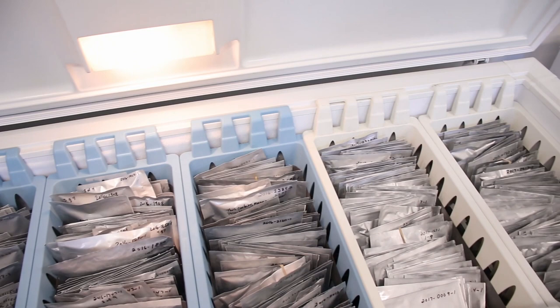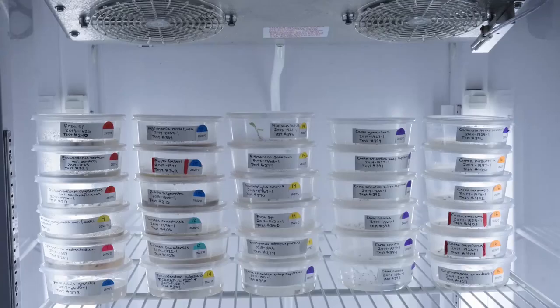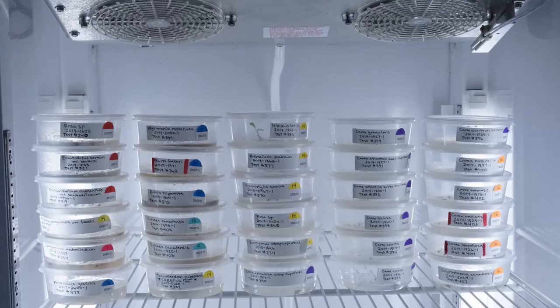Here at the seed bank, my main focus is viability testing. So what I do is pull a sample of seeds from the freezers and see if I can get them to grow. I start by planting the seeds on agar plates, and then I place them into germination chambers, and hopefully this happens.